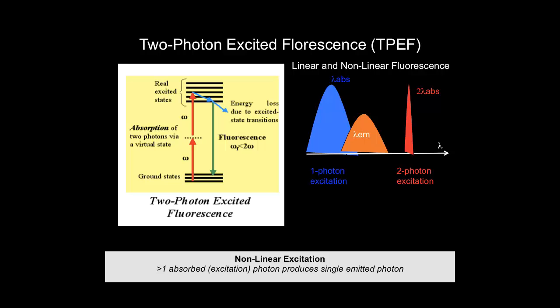Oh, please don't get confused with what I said before. For this one, you use a single beam. So the photons are absorbed from the same beam, and they are absorbed simultaneously in a very short amount of time. That's on the femtosecond scale. If you think about it, femtosecond means 10 to the minus 15 seconds. That's really simultaneously.